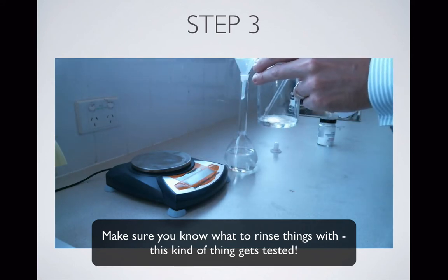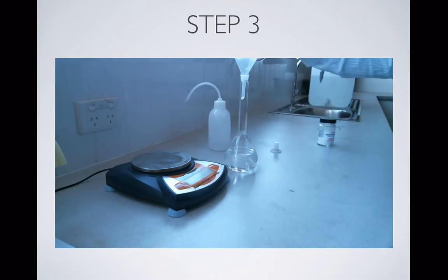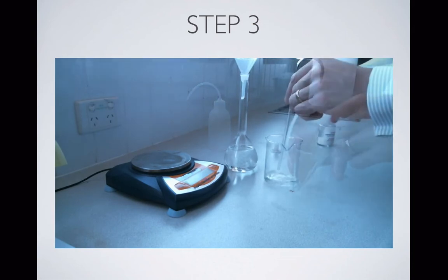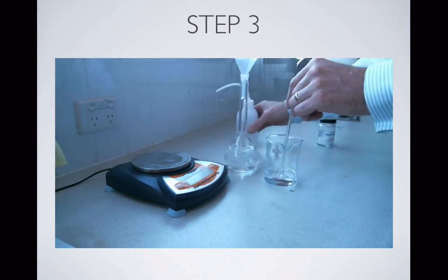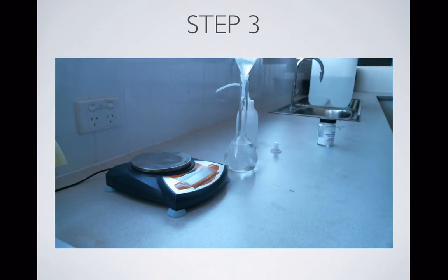As you can see, we're putting plenty of distilled water in here. We're making sure that we rinse not only the beaker but also the glass rod and the funnel that we've been using, so that every last bit of solid ends up in the volumetric flask, which, remember, should have been rinsed with water before we started.